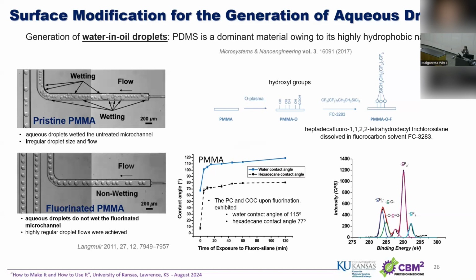And we just, without shame, borrow from the glass chemistry. When I started in Dr. Soper's group, we knew there was a lot of nice chemistry developed for glass, but there were generations of researchers in Dr. Soper's group who worked on developing that chemistry to work with thermoplastics.